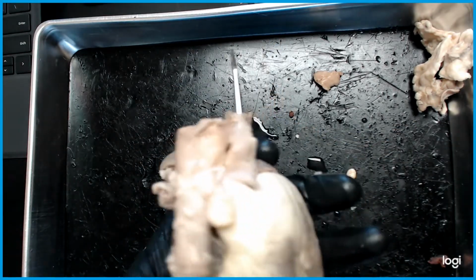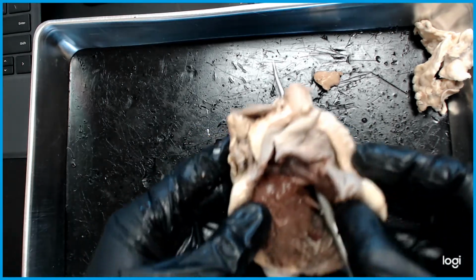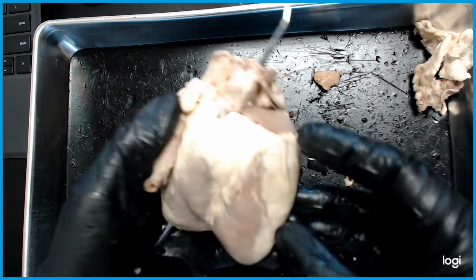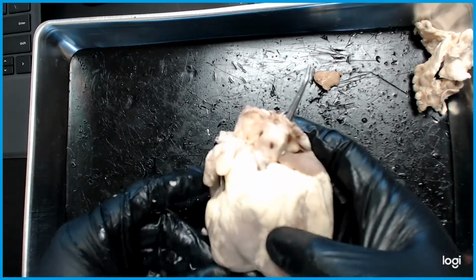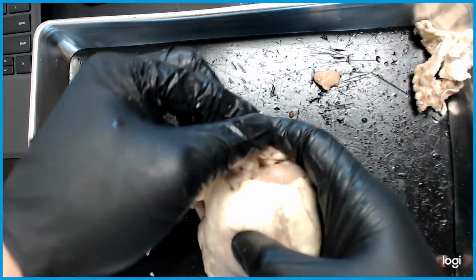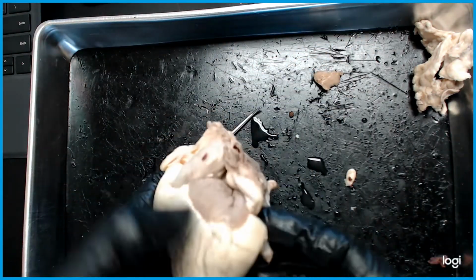The trunk is just the bottom portion? So I'm not going to cut this open yet because I don't want to destroy the rest of the tissue. Now we're going to focus on the left side. If you think about it, we're done with the right. Now we're going to go with the left side. So we can remove the probe. We'll go back to it because we are going to open it up so we can see that valve that's in there as well.